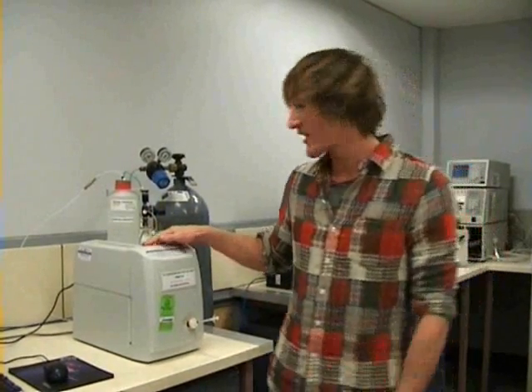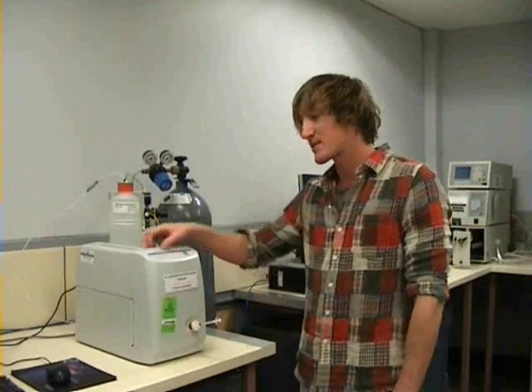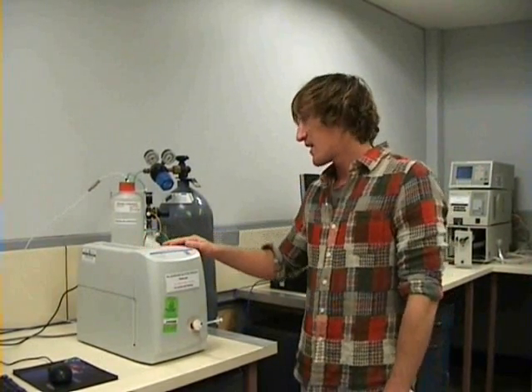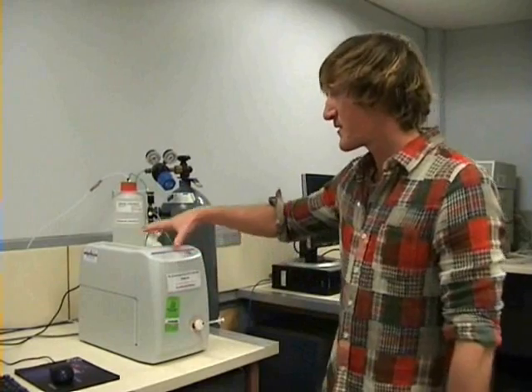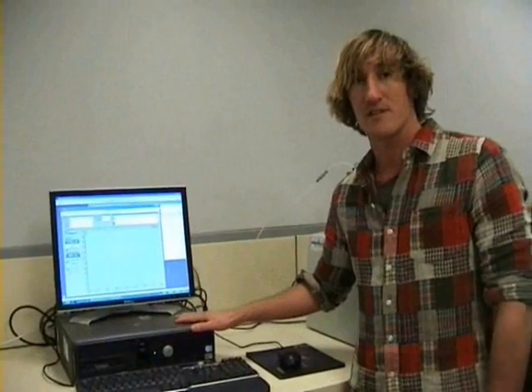Hi guys, I'm here today to run through how to use the ion chromatograph system. Here we're working with the Dionex ICS-90, which is basically the measurement and separation system. This moves on to the software and computing part of the process.